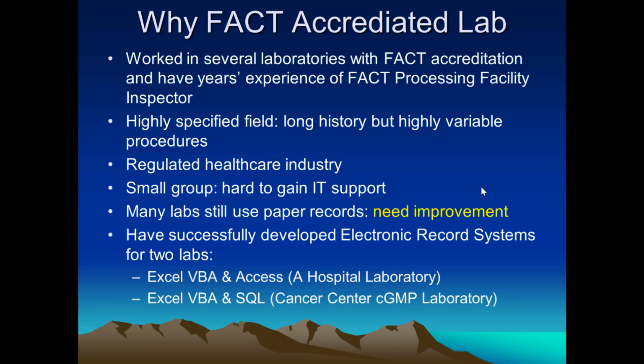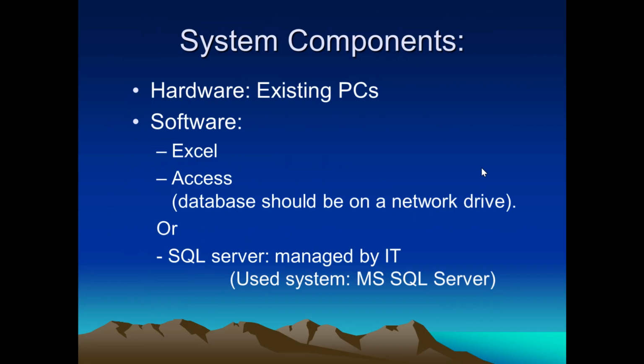One is a hospital lab, using just Excel VBA and Access database software. The other goes further for a CGMP facility, because you may get audited by FDA, so it needs stricter requirements for data security. So I used the SQL database.